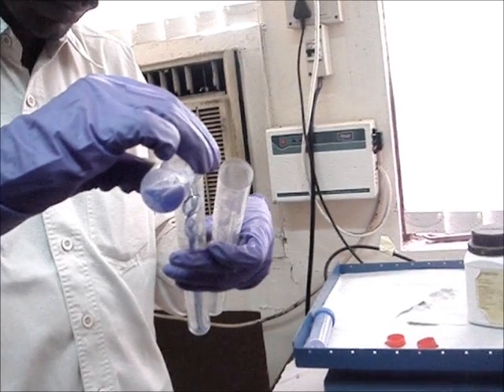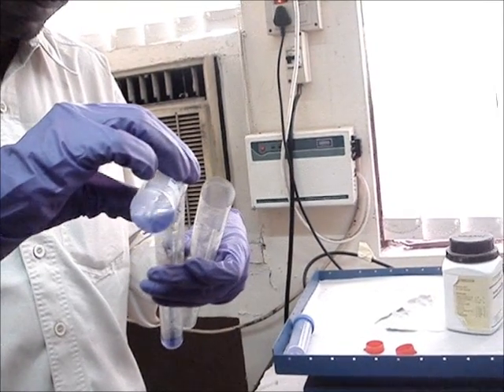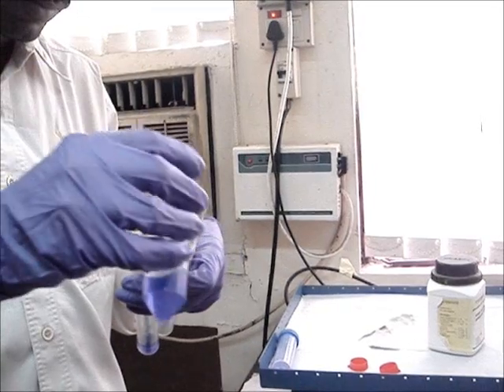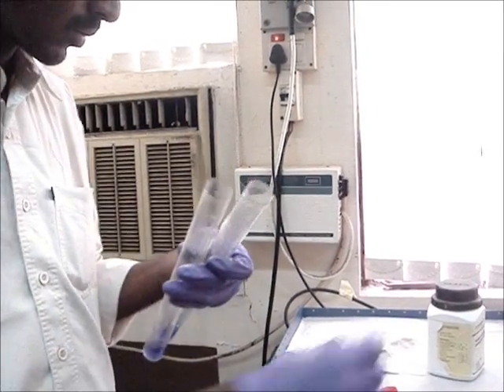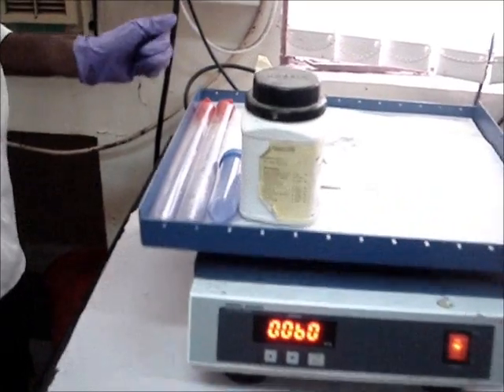Step 3: Equilibration of strips. Add the strips to tubes containing DTT. Place them on a shaker for 15 minutes.